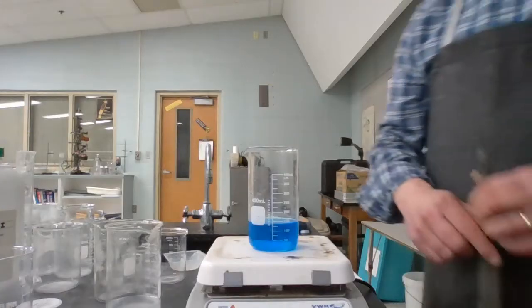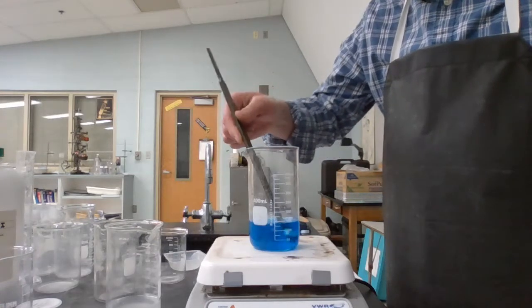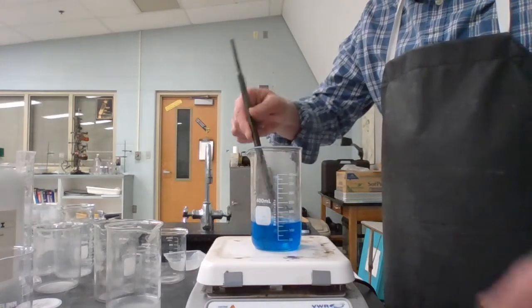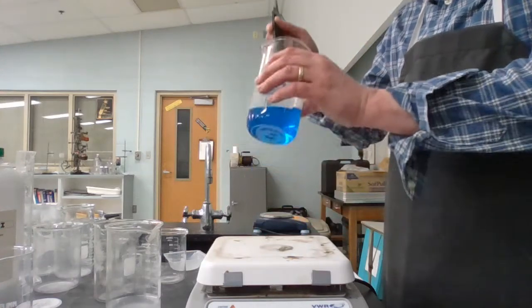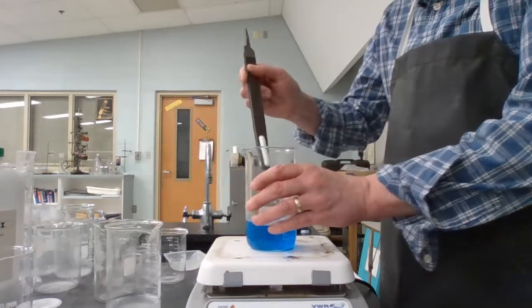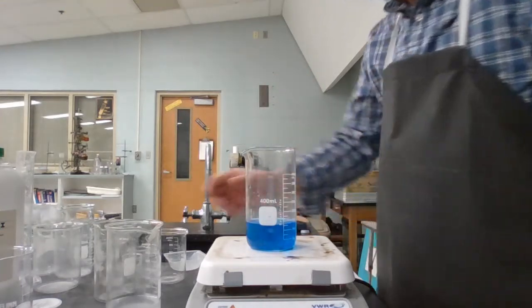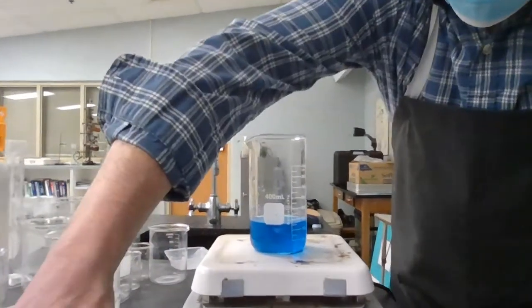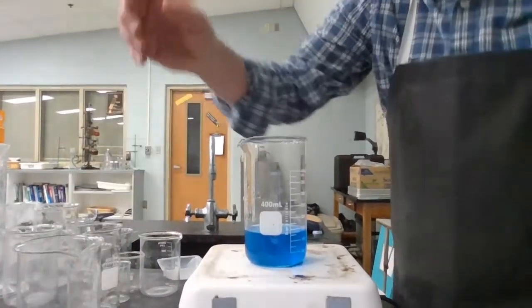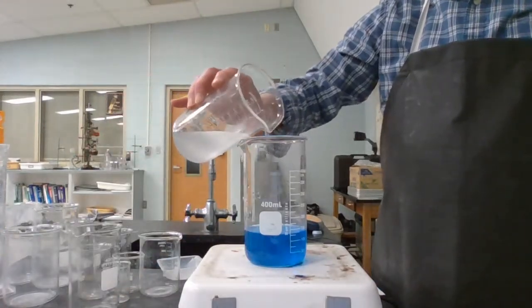All right, reaction 1. Let's take that magnet out of there. Not very magnetic. Oh, maybe because of the other magnet? Yeah, that other magnet in the hot plate was causing me trouble. All right, I got it. All right, here we go. First reaction. Let me move you up a little bit. So sodium hydroxide and copper sulfate.